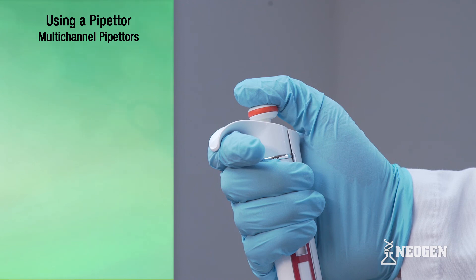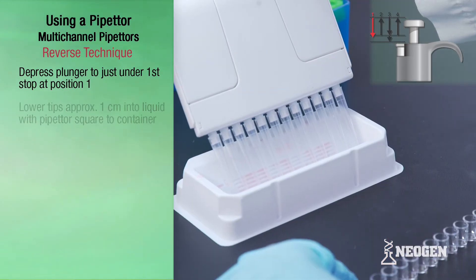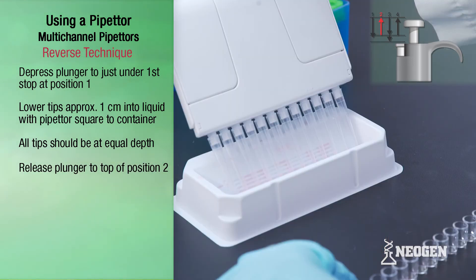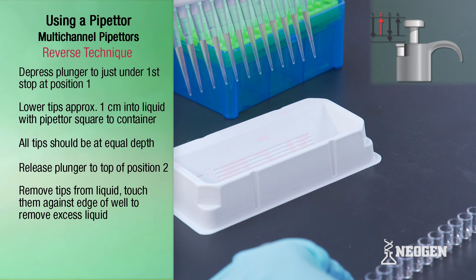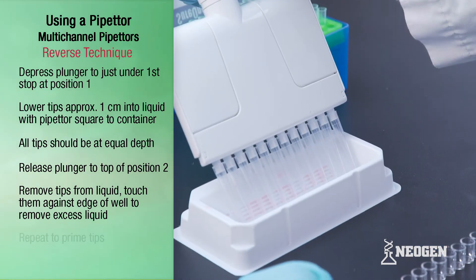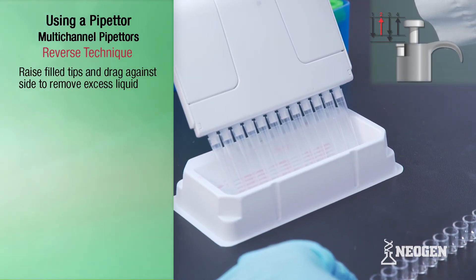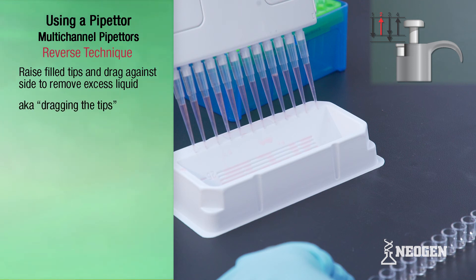To use the reverse or overfill technique, depress the plunger knob to just under the first stop at position one. Lower the pipetter so that the tips are just under the surface of the liquid about one centimeter, with the pipetter square to the wells or reagent boats so that one end is not higher or lower than the other side. Slowly release the plunger knob all the way to the top of position two — this action fills the tips. Withdraw the tips from the liquid, touching against the edge of the container to remove any excess liquid. Repeat the steps to prime the tips. Next, raise the pipetter with the filled tips and drag the tips against the side of the wells or reagent boats to remove any liquid that may have stuck to the outside of the tips; this is known as dragging the tips.